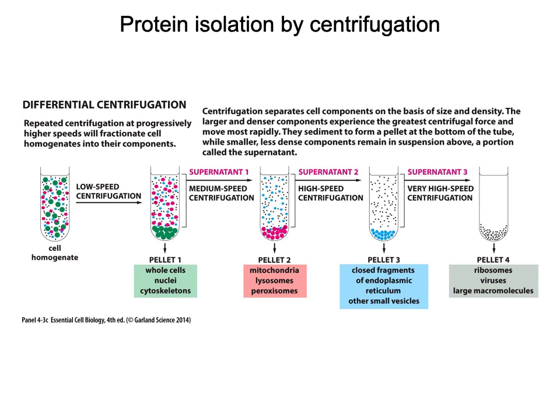Okay, so we're starting here with our cell homogenate, our extract. Maybe we've added detergent, we've ground it with our disposable mortar and pestle. So if we put it under low centrifugation, what's going to be in our pellet are larger structures. So we might have nuclei, we might have cytoskeleton, but in that supernatant, some smaller organelles might be present. Okay, so before centrifugation, this would be a whole cell lysate. With centrifugation, even at low speeds, we're starting to separate out parts of the cell.